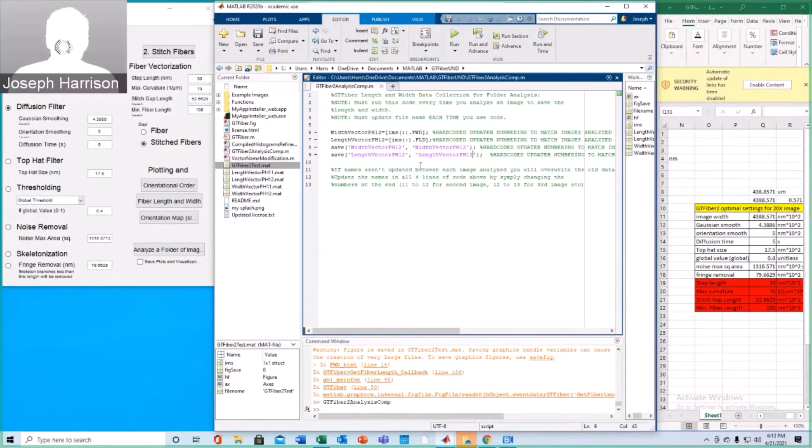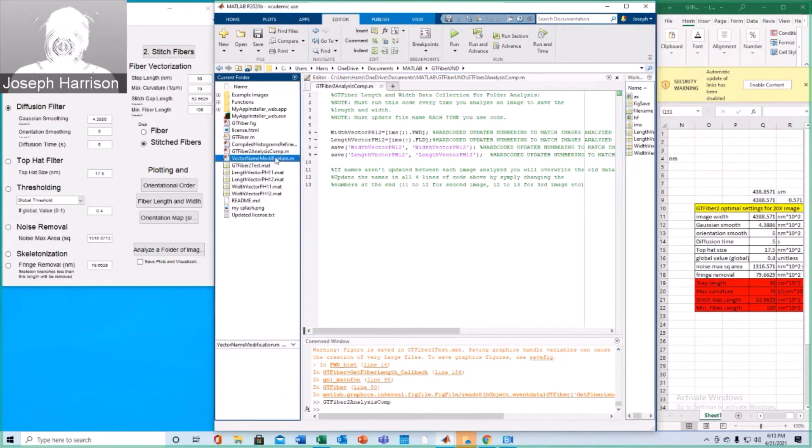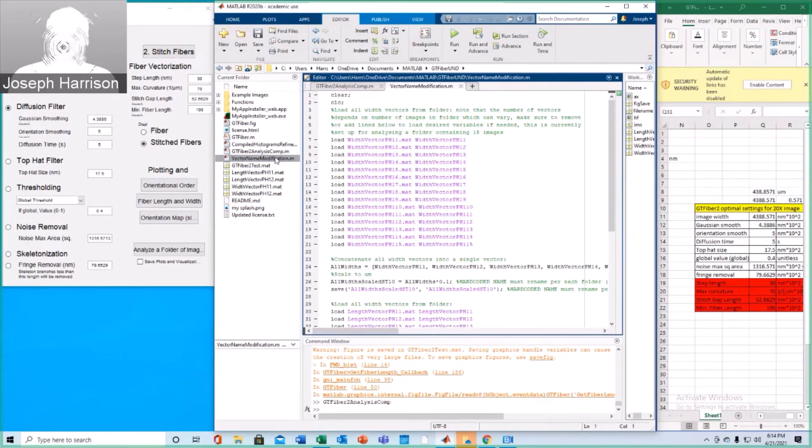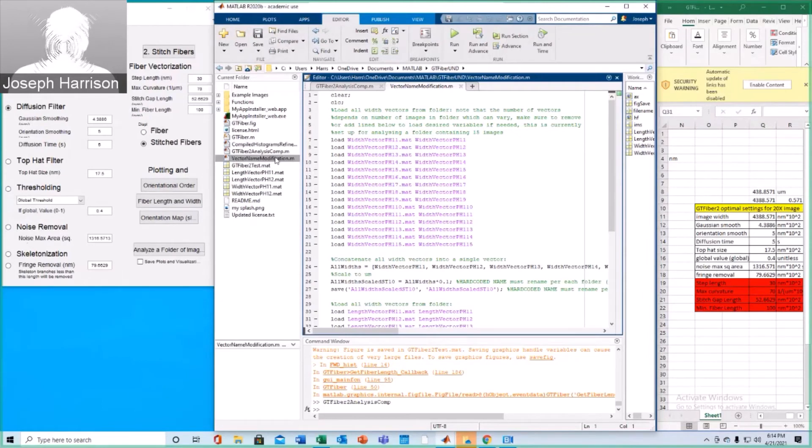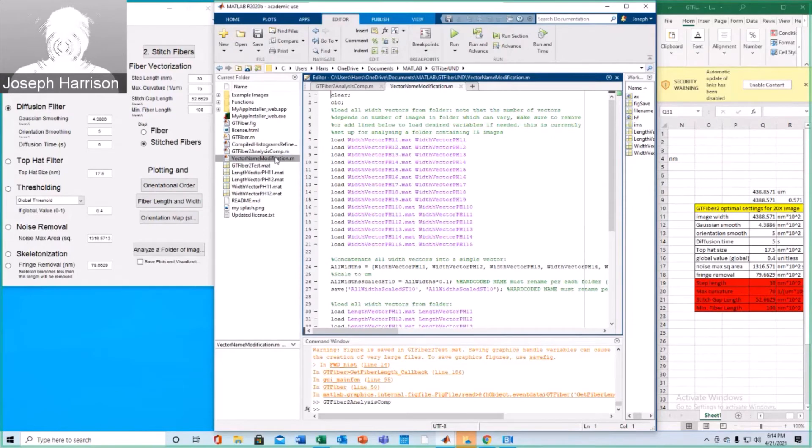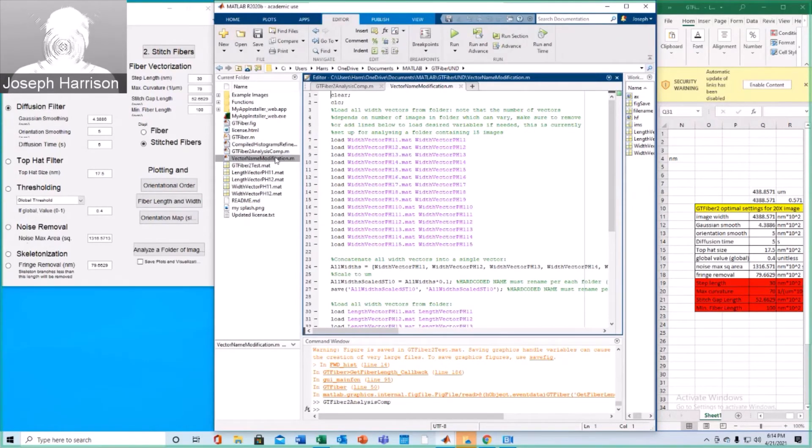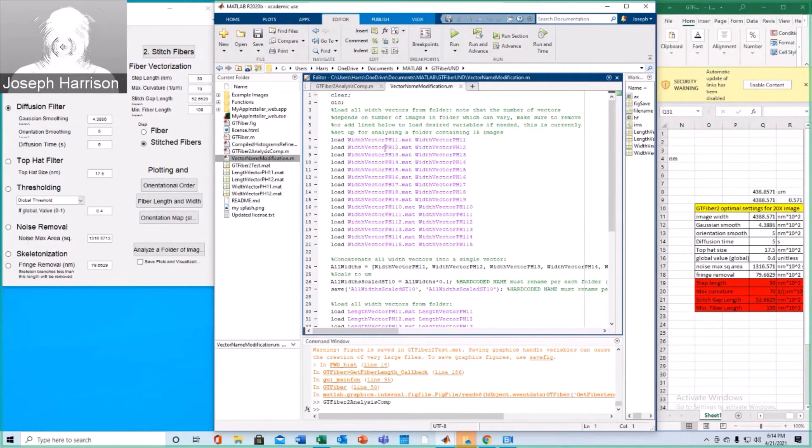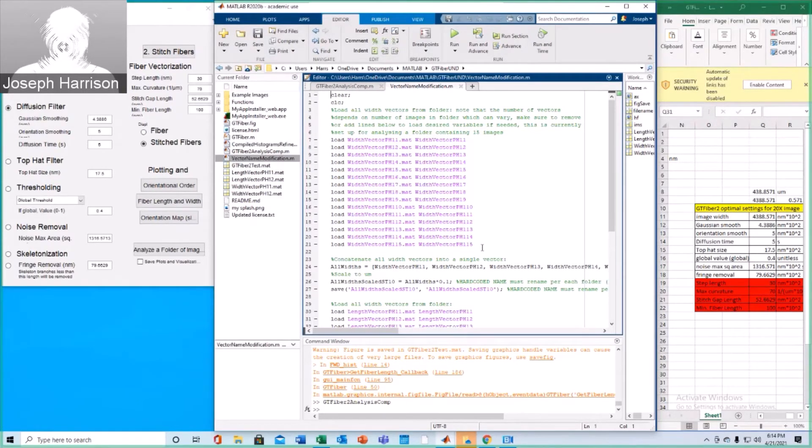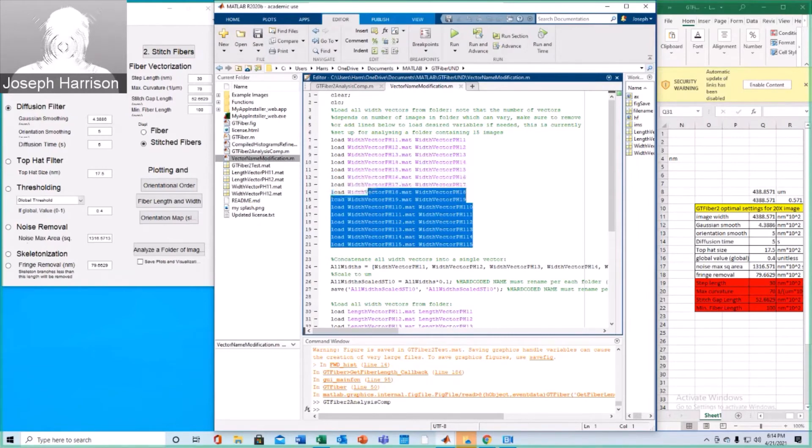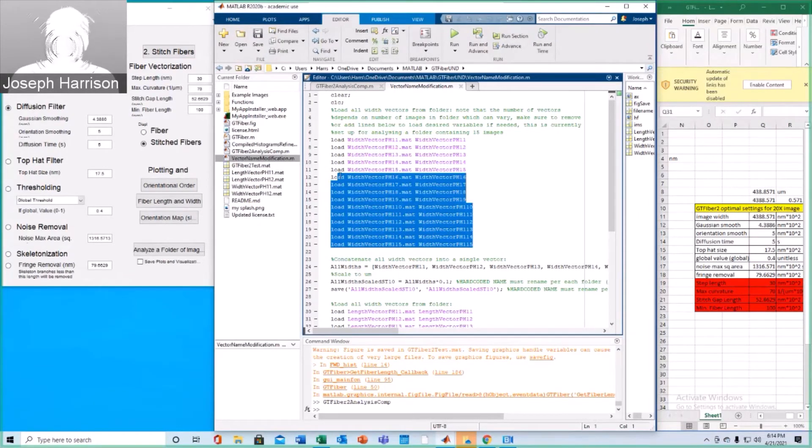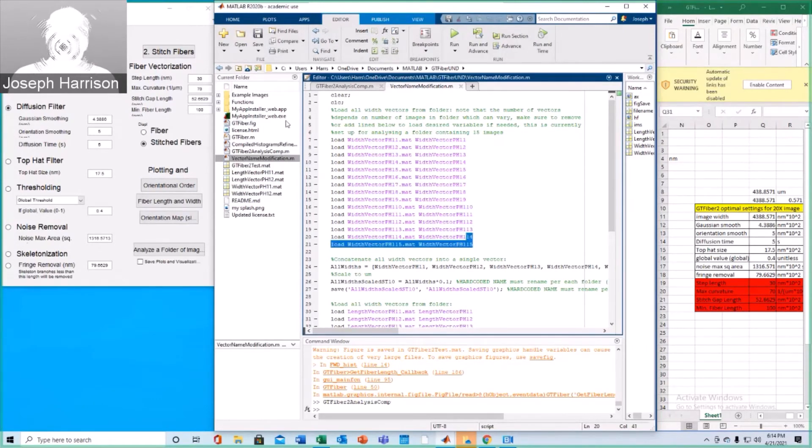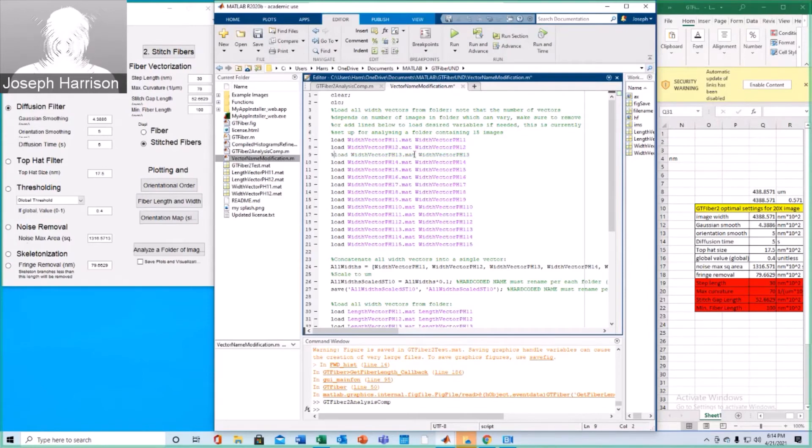Now we're going to open up this name modification script. Running this script compiles all lengths and width data vectors from the folder of images you have finished analyzing, and compiles them into respective length and width vectors that contain all fiber lengths and widths from all images analyzed in the folder. Just make sure to change hard-coded names as needed, much like the previous file. As you can see here, we're only going up to ph12, so we don't want all of these other variables to try to be loaded because they do not exist. This is pretty much coded for a 15 or 16 image folder. So we'll go ahead and comment these out so that they don't actually run. Again, this probably isn't the most efficient way.